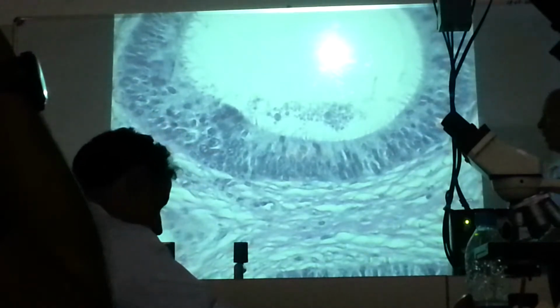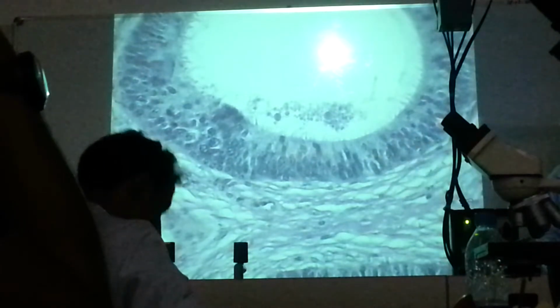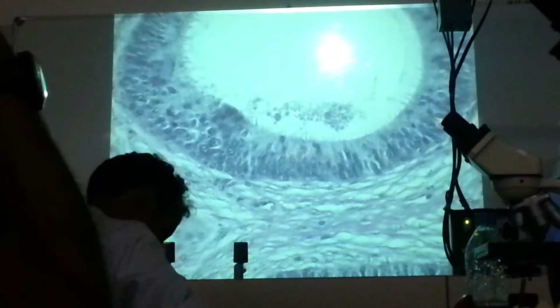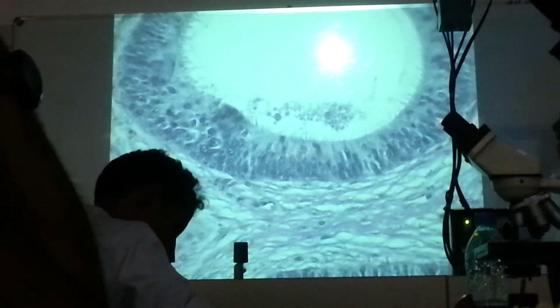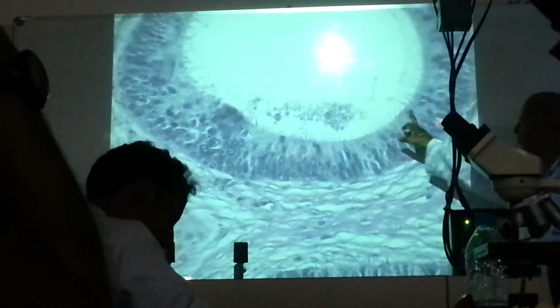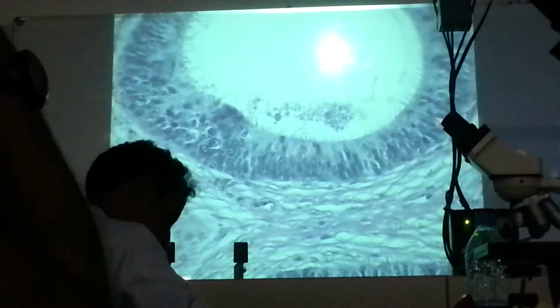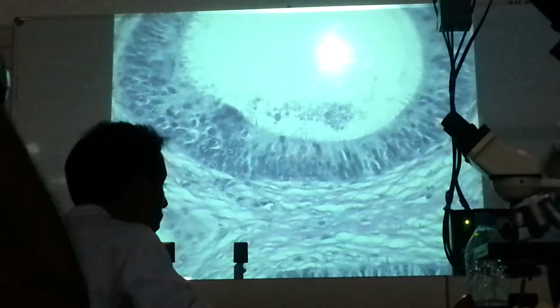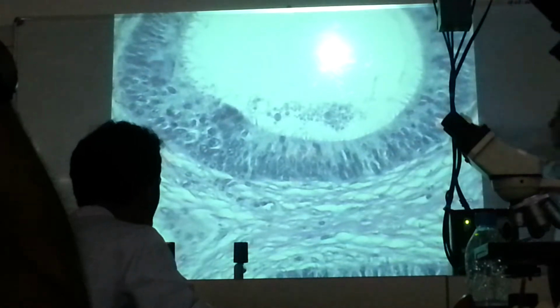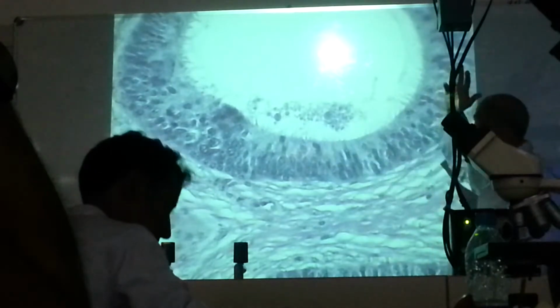What's the type of epithelium? Pseudostratified columnar with stereocilia. Why? One layer of cells. Nuclei are oval and basal. Surface is provided with stereocilia. You may add, all cells do not reach the surface, but the tall ones go to the surface.